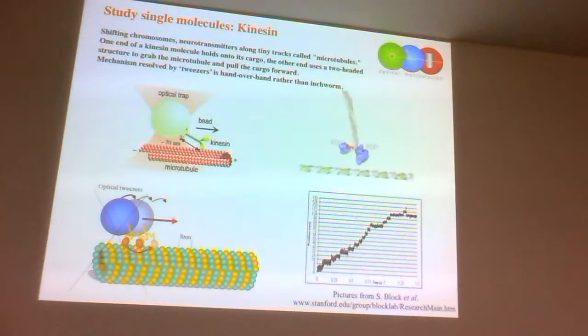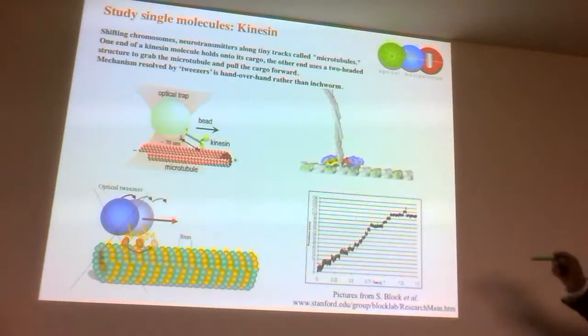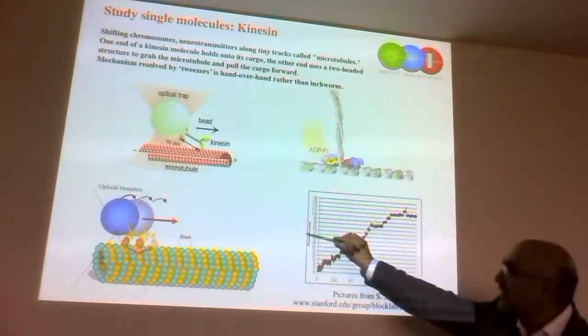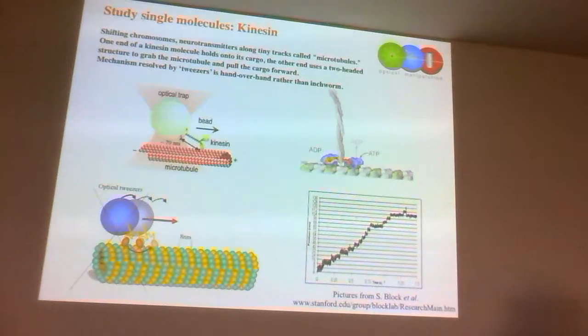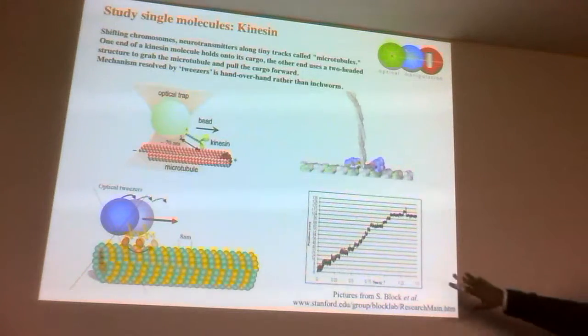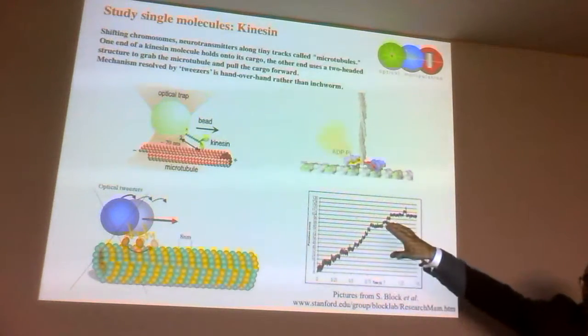It's been revolutionized since 1986 with optical traps. There are about one order of magnitude more groups in biology using optical tweezers than physics. A lot of people don't know that. So that's how it's done. And so instead of trapping the kinesin directly, they attach it and they watch the little optical trap wiggle. Remember that quadrant photodiode? Watch it wiggle. And then we use that, for example, to take this measurement as it carries something along that microtubule.